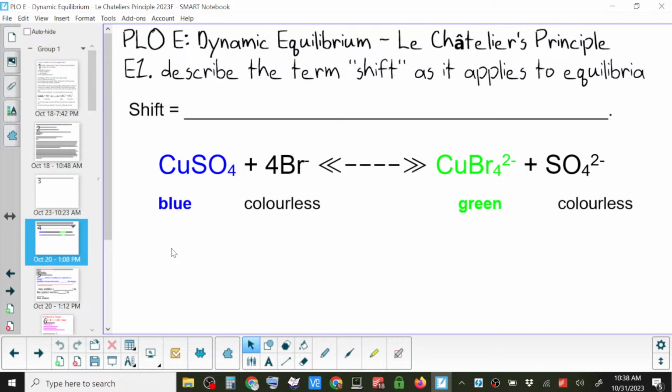Okay, for the first one, we're going to take ammonium sulfate. I'm going to take about 50 grams. Ammonium sulfate will shift it which way? Will it become more blue or more green? More green. Why more green? Because it will be a bit more acidic. Because it'll be ammonia. It will be, I mean it will, but do we see H plus anywhere in the solution? No. So we're looking in ammonium sulfate.